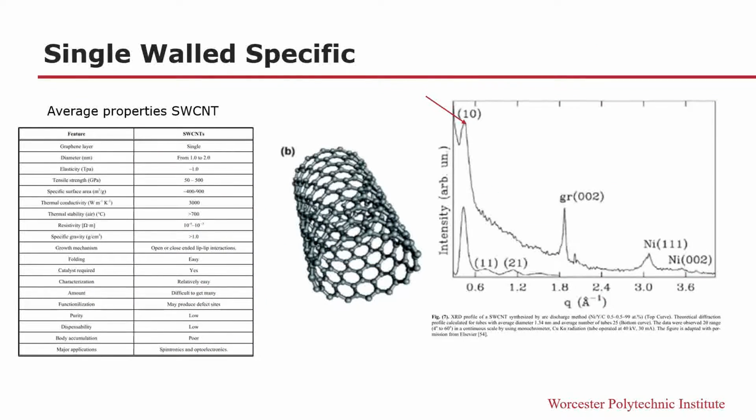Single-walled carbon nanotubes are the stronger variant of nanotubes and are also generally harder to produce. Their structure does not have many complications besides the standard diffraction results, but identifying single-walled carbon nanotubes versus multi-walled carbon nanotubes can be performed using X-ray diffraction.